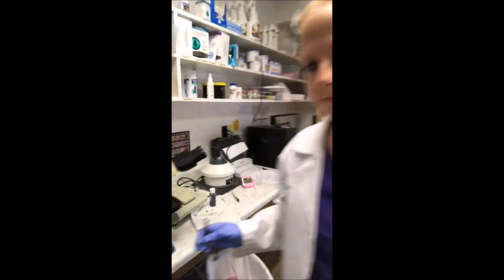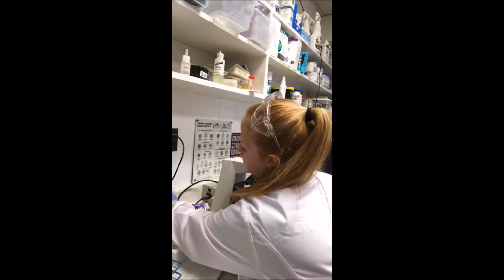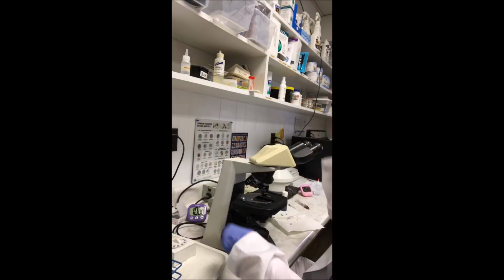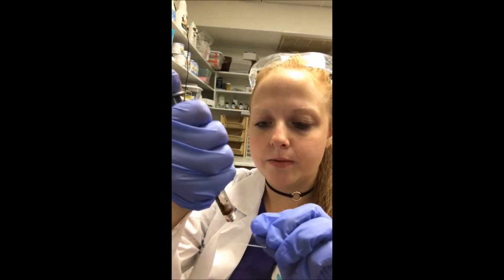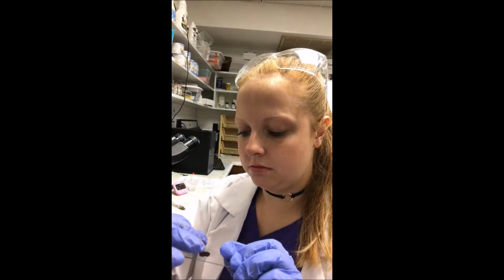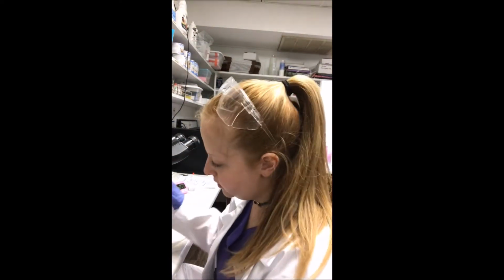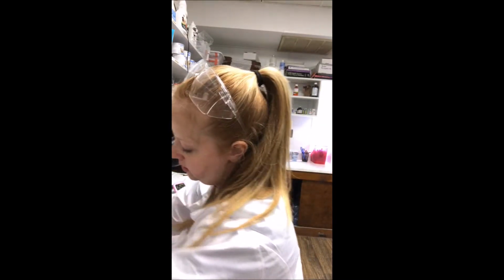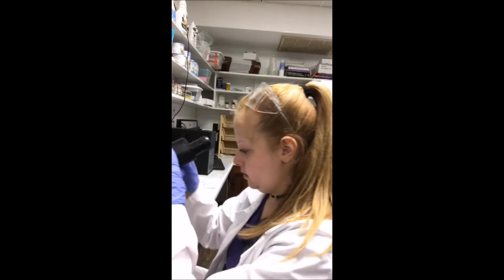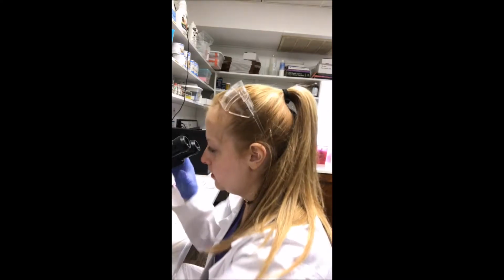So we're going to come over here, and I'm just going to get a clean microscope slide. I'm going to put a drop on the microscope slide, and we're going to add a cover slip over it. Okay. And we're going to turn the microscope on, and we're going to look under 10 times power. Good and focused here.